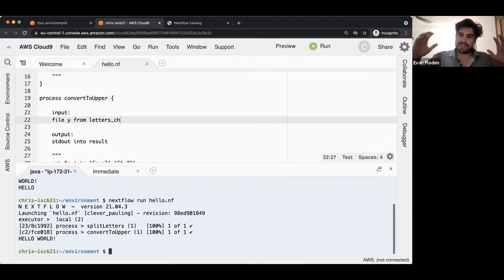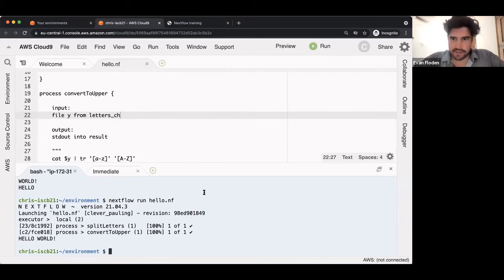You can think of the model as Nextflow creating tasks based on the number of elements it receives. A little bit like we saw in the original example, if it receives a single FastQ file, it's going to run the task once. If it receives 1,000 FastQ files, it's going to submit 1,000 tasks. That's the main model of the way it works. Is that kind of clear? A little bit clearer as to why we use flatten?